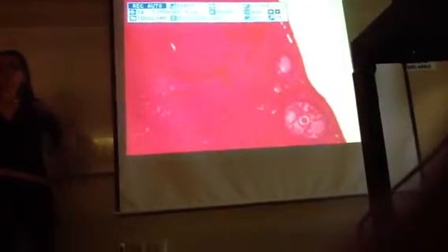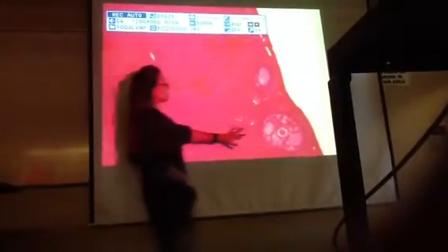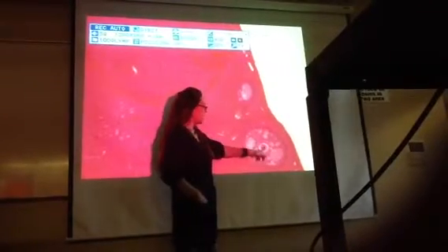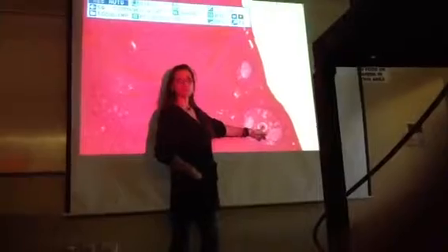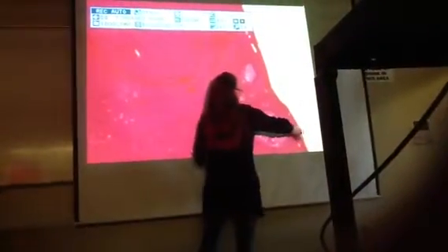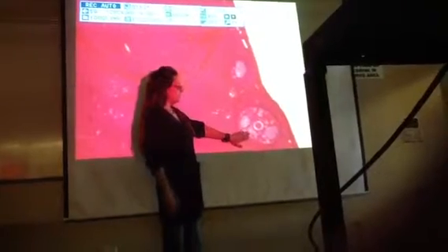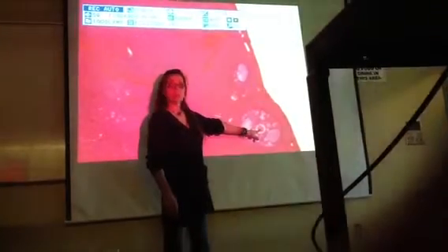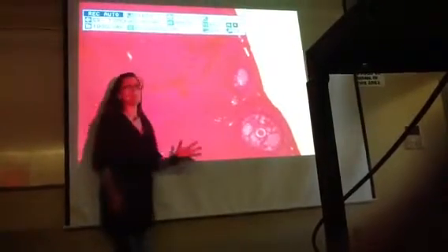And again, the oocyte could be at different stages of development depending on whether it is younger or older, and where it is in terms of meiosis. But that's what you want to look for. What we're looking at right here, this is a follicle, this round circular area. And right here in the middle, that is your oocyte. So if I were to point to this, I might ask, what am I pointing to? This here would be pointing to a follicle. This would be pointing to an oocyte in that follicle. And the slide would be of the ovary.